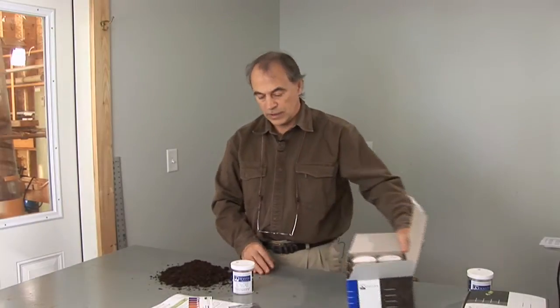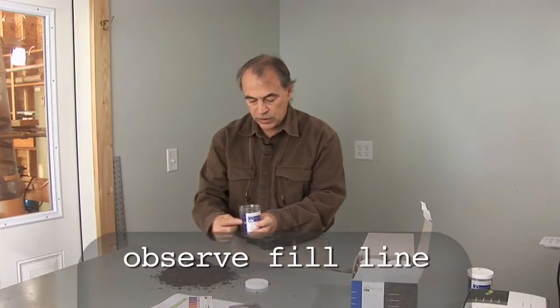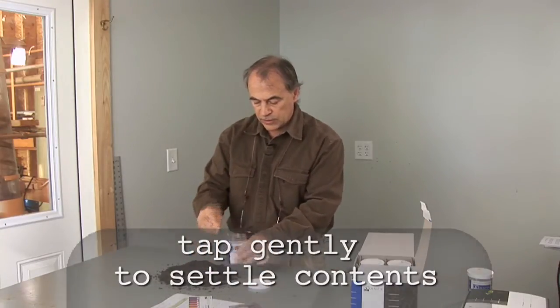Let's load the jar and do the test. Open up the incubation jar and begin to fill the jar, being aware of the fill line on the side of the jar, tapping the compost so it goes to its natural state of density.